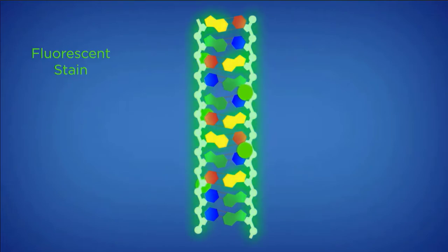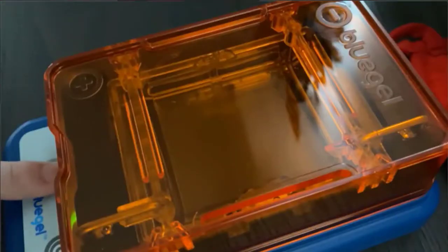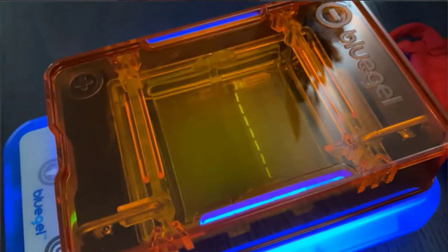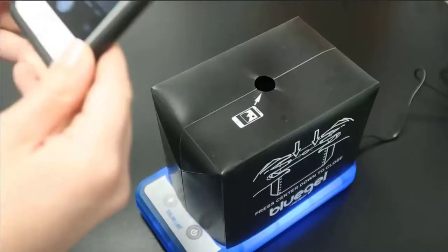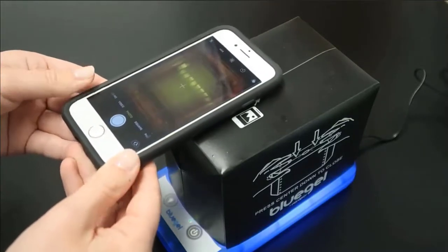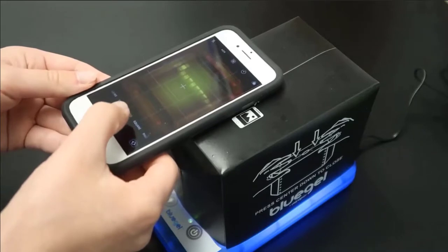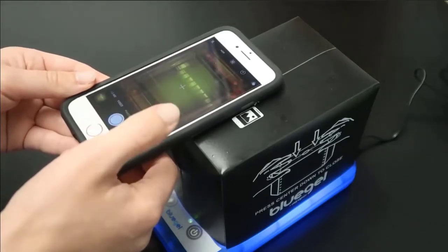Using fluorescent stains, we can visualize our DNA just by turning on a safe blue light. Here, in our blue gel electrophoresis system, we can simply turn on the light to visualize our DNA and directly capture images using a smartphone, without transferring the gel to a second location. Using a dark hood can help to see the bands in a bright room. We can even use our phones to make a movie of our gel as it is running.